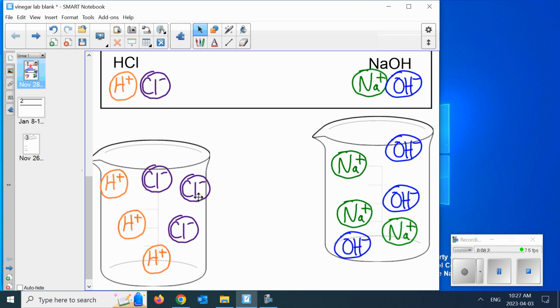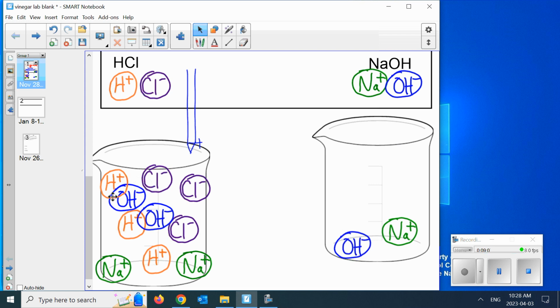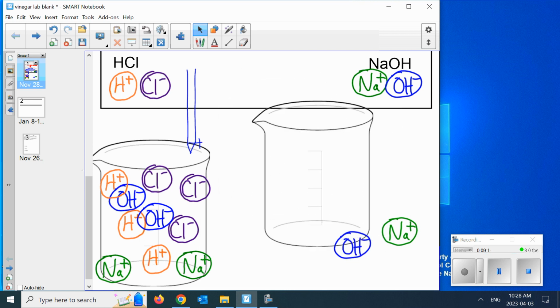I'm going to use a burette, which you've seen before, and we'll take a look at it again, which is basically like a graduated cylinder with a little tappet to allow it to just drip, drip, drip, right? And when I add it in, so I'm dropping it in, and then there's some sodium hydroxide. The really important thing is that the H's and the OH come together. Okay, right now I've reduced the acidity of the left beaker. Added some sodium hydroxide. I'll add some more. It'll still be clear and colorless. So add some more sodium hydroxide. Okay, another neutralization there, right? We're not quite there yet. One more drop.